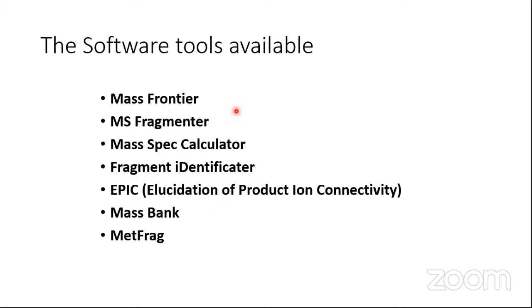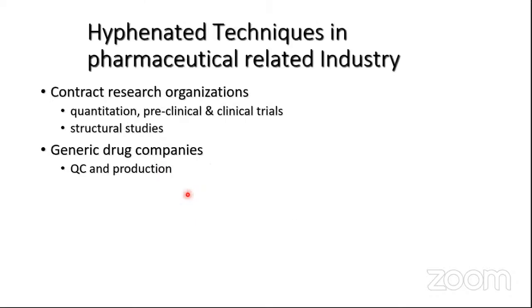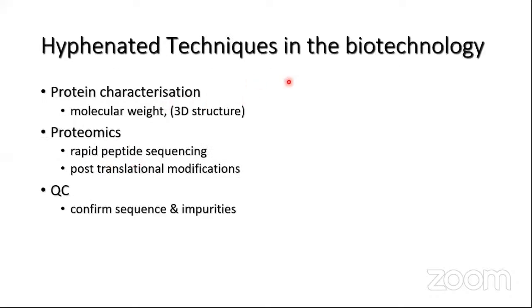I think that's all. I had to really rush through my presentation, but LCMS and GCMS are used for many such applications. I will quickly run through a few slides. Pharmacokinetics, formulation, QC and production, contract research organizations, generic drug companies, the pharmaceutical industry uses them very much.